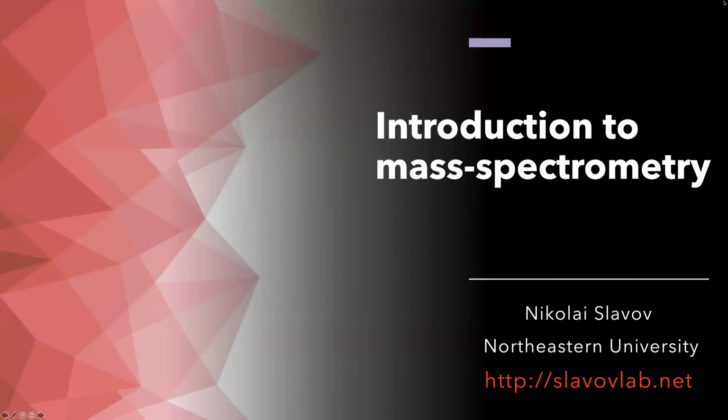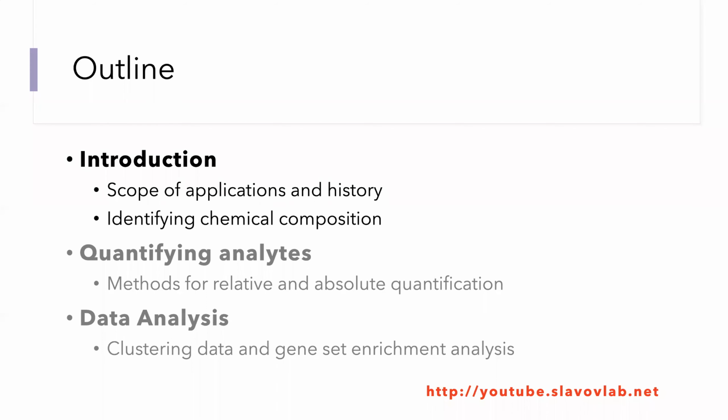Welcome to this introduction of mass spectrometry analysis. In this lecture, I will briefly summarize some applications of mass spectrometry and the history of the field. Furthermore, I will outline some of the fundamental principles used to identify the chemical composition of analytes analyzed by mass spectrometry.